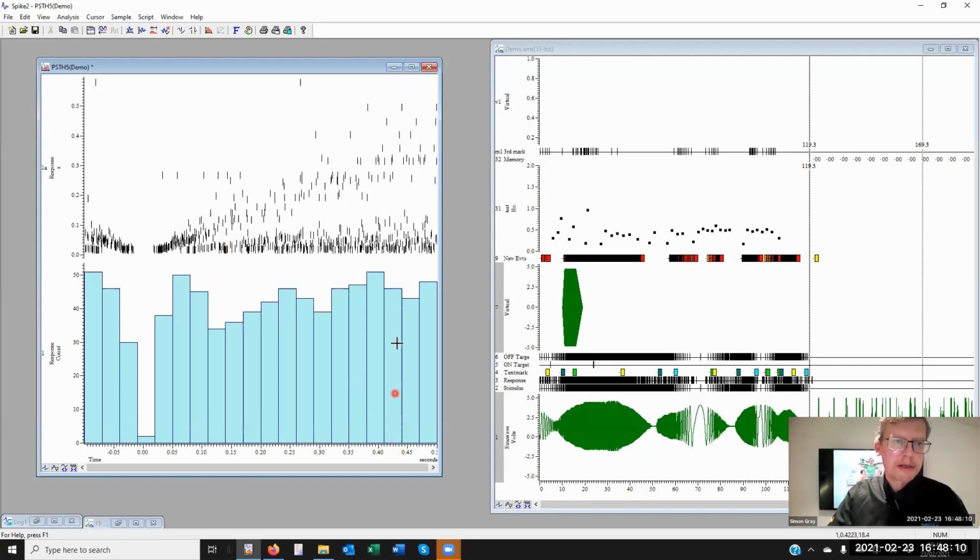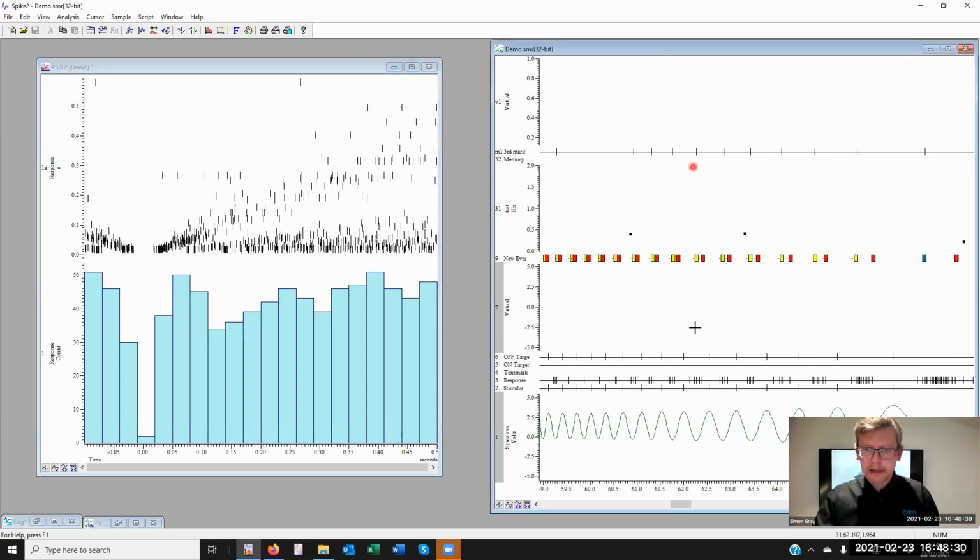events, the third event. And I think the reason I'm not getting it is because I'm using a PSTH, and the critical point here is PSTHs exclude data that's previously been used. So the reason I'm not getting so many outputs is if we zoom an area like this, I would trigger on this first event here on channel 2, and I would get a sweep including this data and maybe some of the pre-trigger.